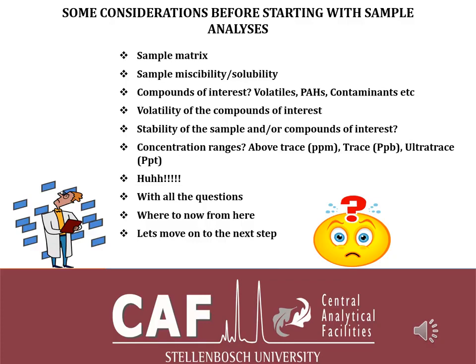Why is that important? It is important because if you're working with ppm, maybe from 1 ppm to 100 ppm, you might have to dilute your sample instead of working in that higher range, because most instruments are very sensitive at above trace in ppm. You might even have to reduce the concentration of the standard, because for some instruments, depending on the compound, you might lose linearity when you work at higher concentrations.